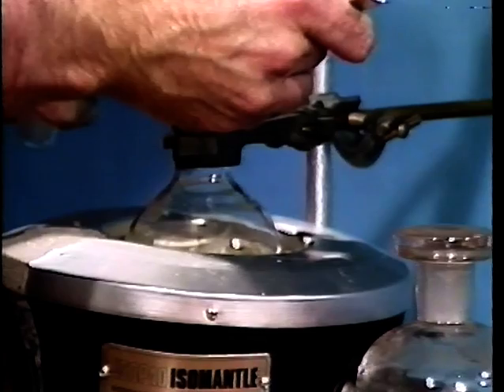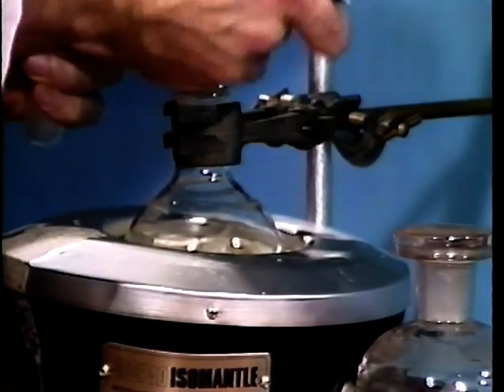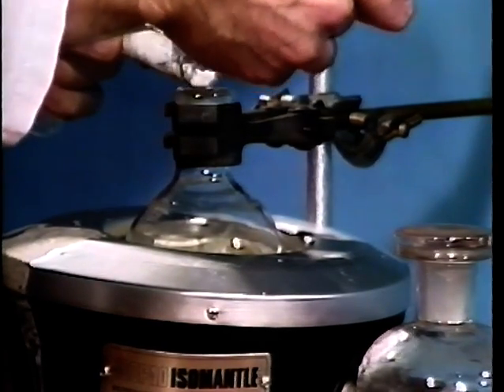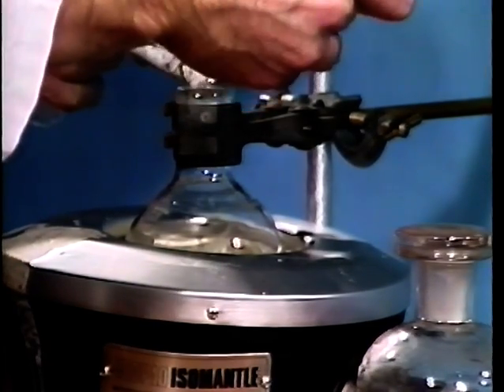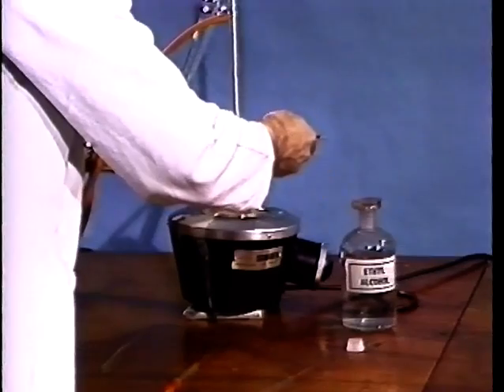The procedure that you see here is recommended for experienced workers only, those with steady hands. It is recommended that you use a funnel or powder funnel in order to add the solid to the flask, in order to avoid spillage down the side of the flask.